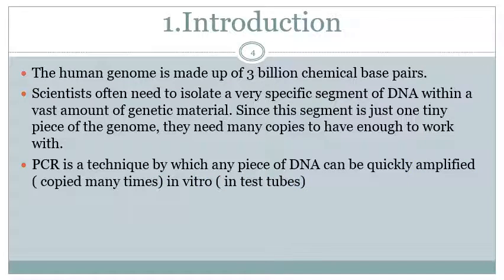So there is PCR technology, which came into the picture: any piece of DNA can be quickly amplified, or copied many, many times, purely in the lab.